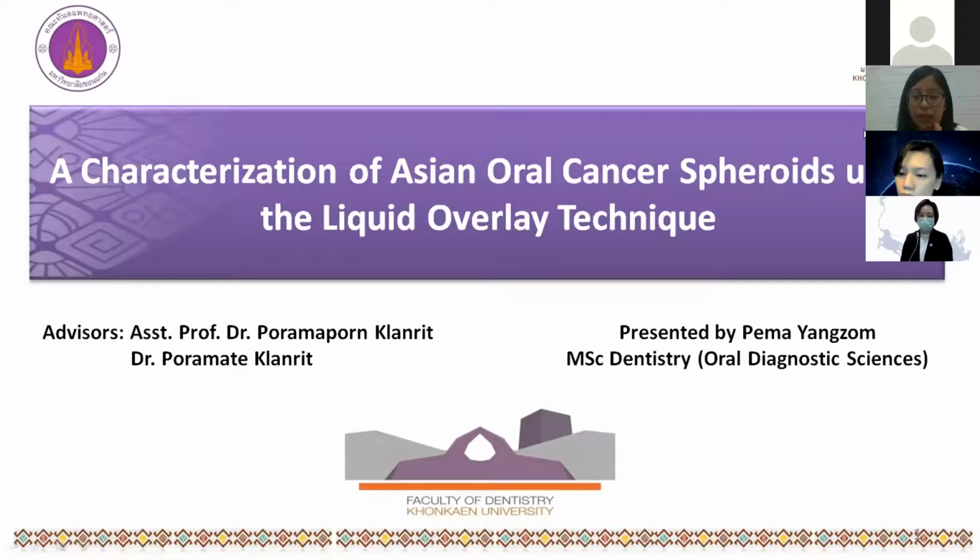And thirdly, it matches our objective, because ultimately the goal of growing in 3D is to serve as a suitable platform for testing anti-cancer drugs. And we can successfully form the spheroid within 2 days, Ajahn, which is suitable for testing the drug. So I thought 7 days is enough, keeping all those objectives in mind.